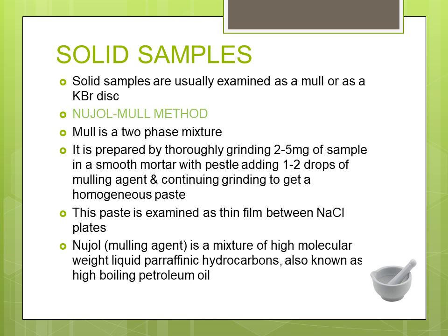Now what is a mulling agent? This is also known as Nujol. It is a mixture of high molecular weight liquid paraffinic hydrocarbons. It is also known as high boiling petroleum oil. So this is used as a mulling agent, also known as Nujol.